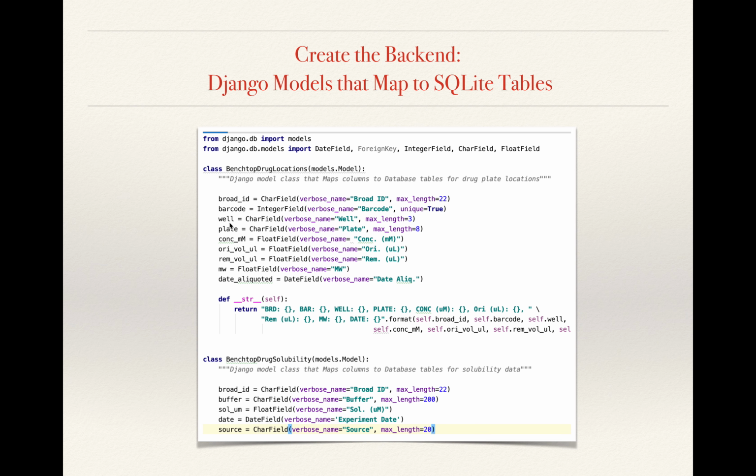This is also very important because a compound can kind of go bad over time, and so I wanted to make sure that I kept that information in my table so that I could query and find compounds that, for example, were only maybe 2 months old.